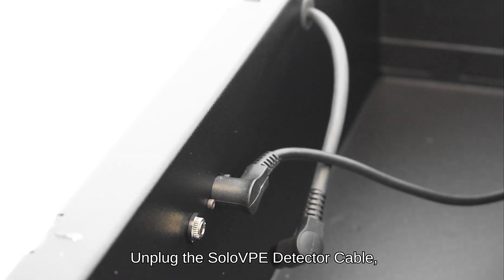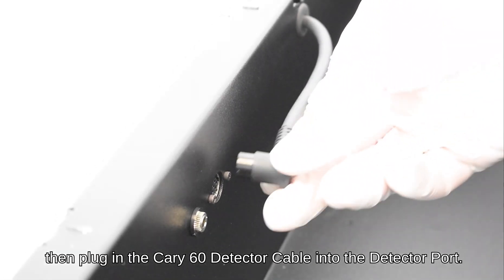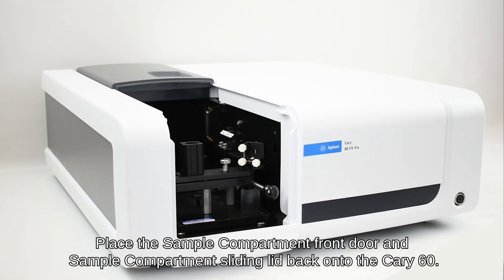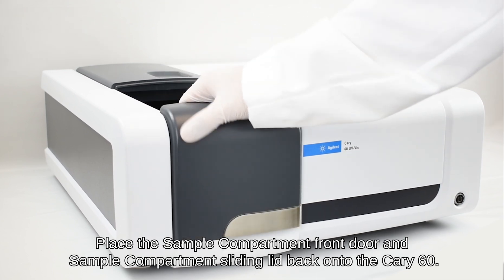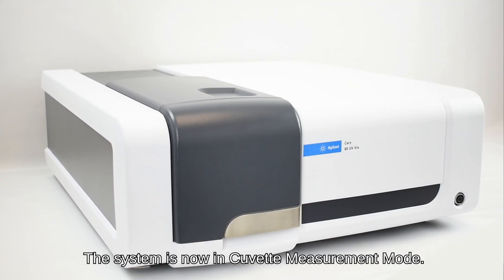Unplug the Solo VPE detector cable. Then, plug in the Carry 60 detector cable into the detector port. Place the sample compartment front door and sample compartment sliding lid back onto the Carry 60. The system is now in cuvette measurement mode.